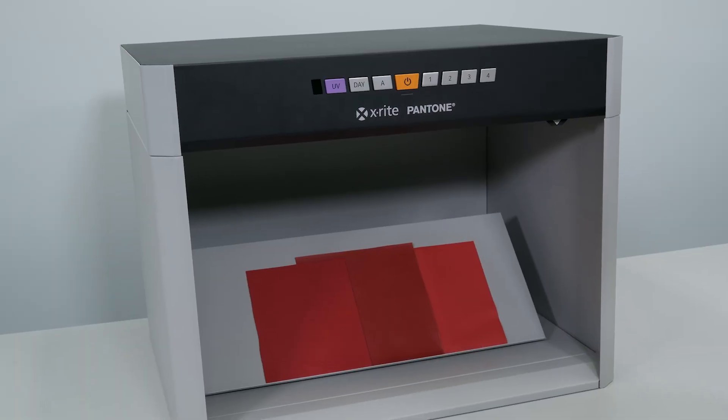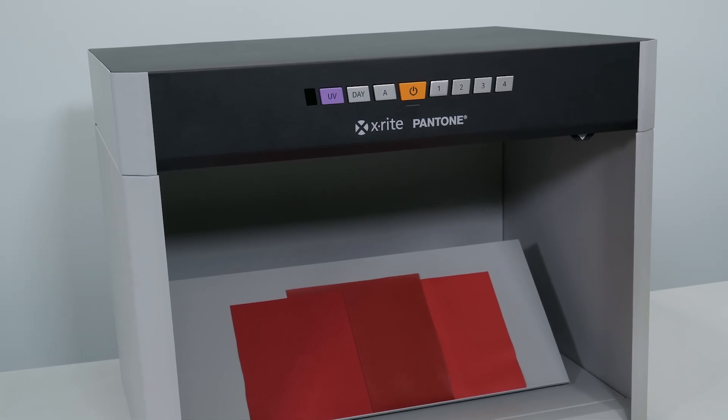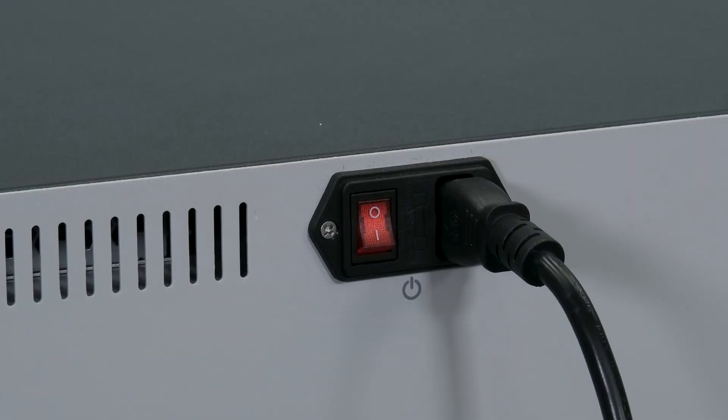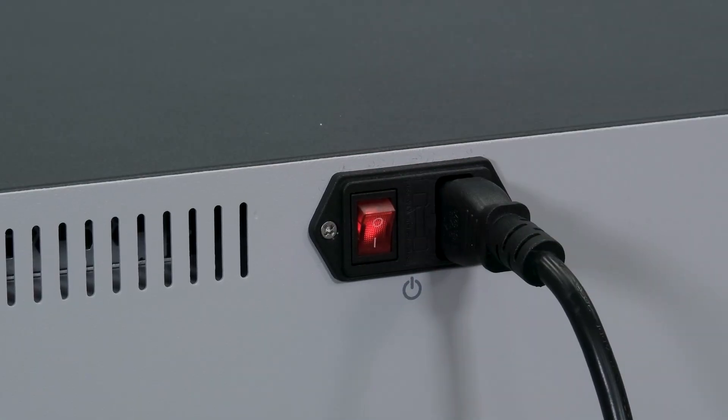The Judge LED light booth features seven illuminants. Before using the light booth, ensure the main power switch on the back is turned on.